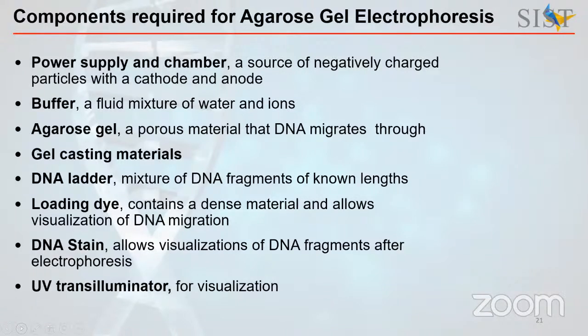And then we need loading dye. Loading dye is a heavy, dense material which will facilitate the migration of DNA through the pores of the agarose gel and make the migration of DNA on the gel visible to the naked eye, because when the loading dye is moving along, the DNA is also migrating on the gel matrix.